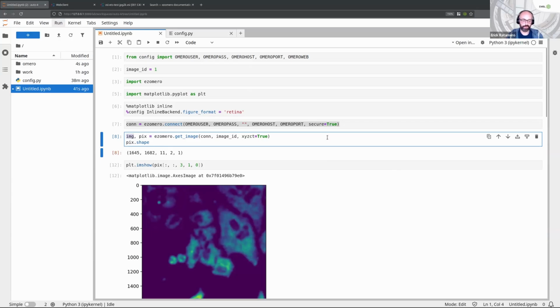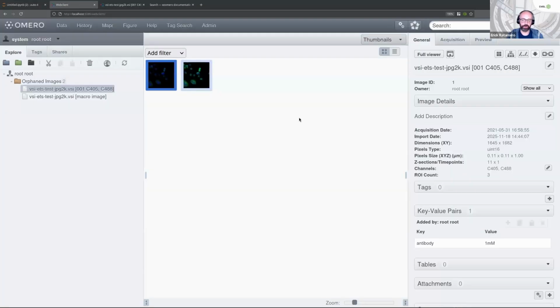So it's not like it's impossible. It's just that you then need to go to the quote unquote real API to actually do work. But the things that people want the most often are here in ezomero, and it's normally the OMERO specific metadata. That's most often what people want when they are talking to an OMERO server, the specific metadata related to OMERO.